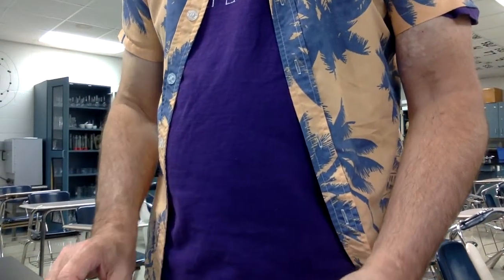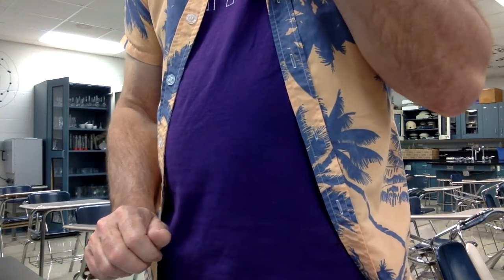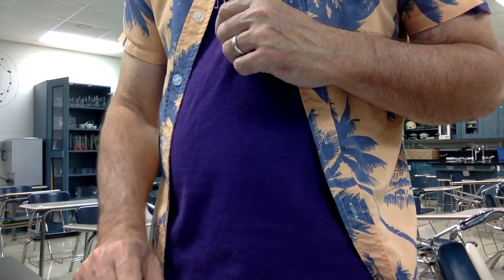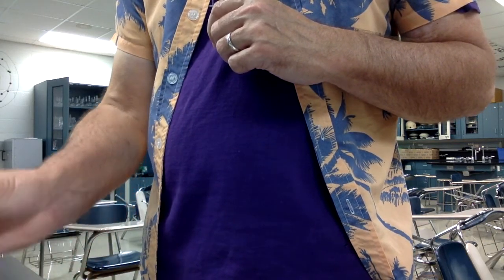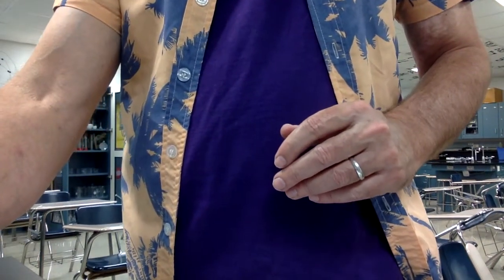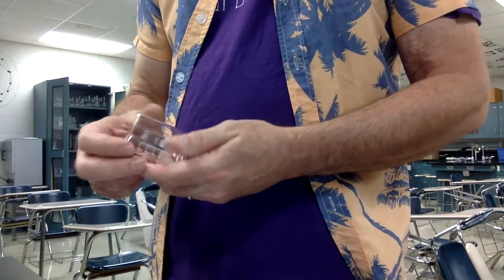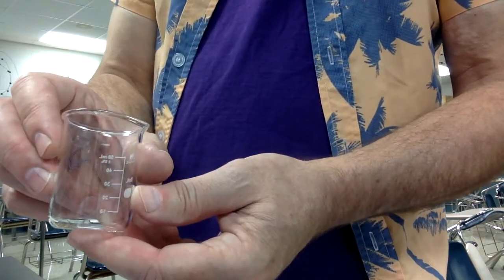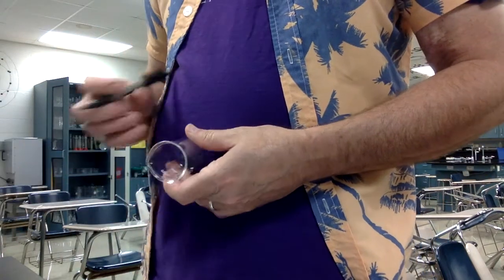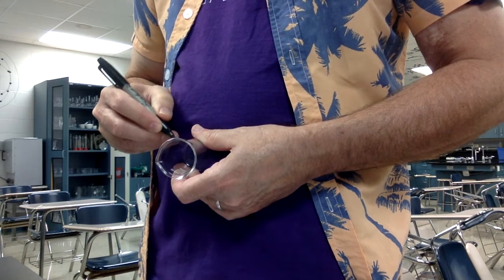Now we're going to use a disposable pipette to transfer as much of the supernatant, which is the liquid part, into a clean 50 milliliter beaker labeled banana extract, making sure that all the solid stays in the tube. So this is my 50 ml beaker, and I'm going to label it green banana extract.